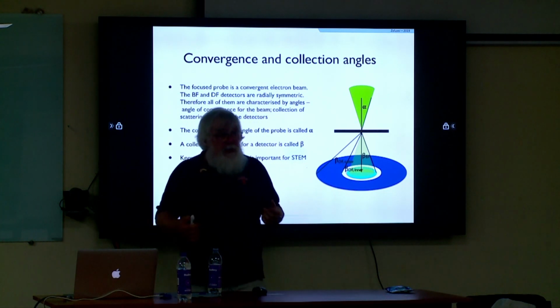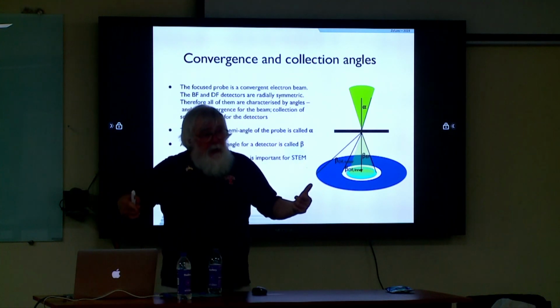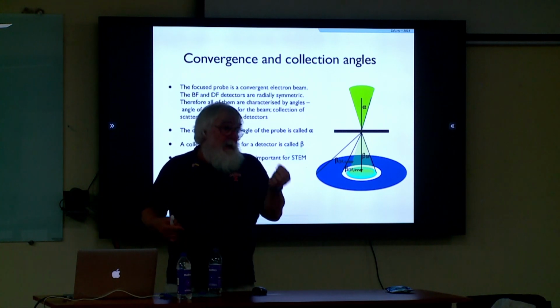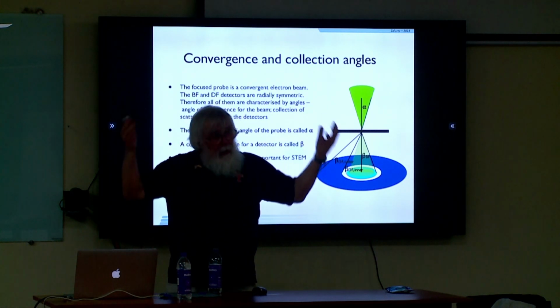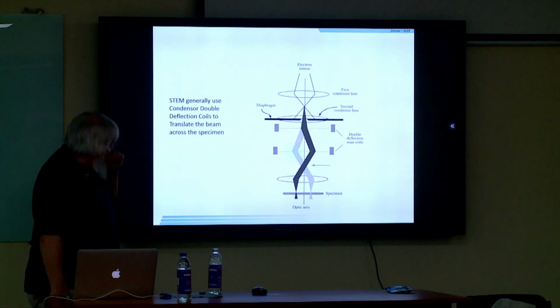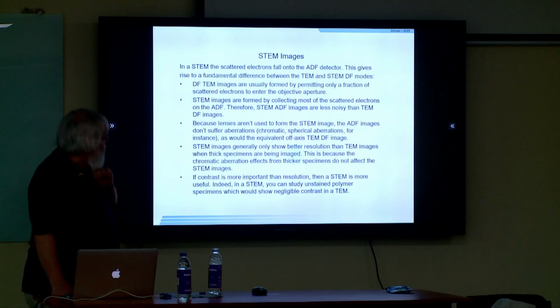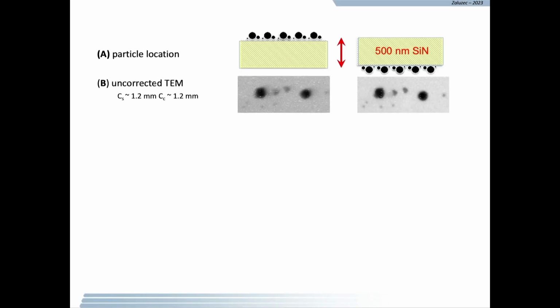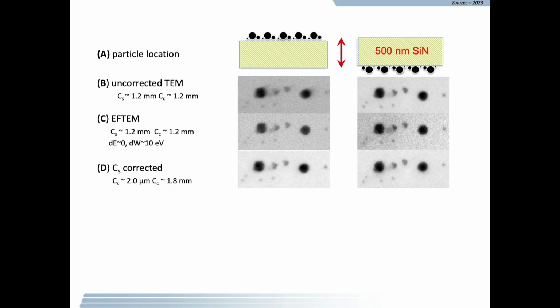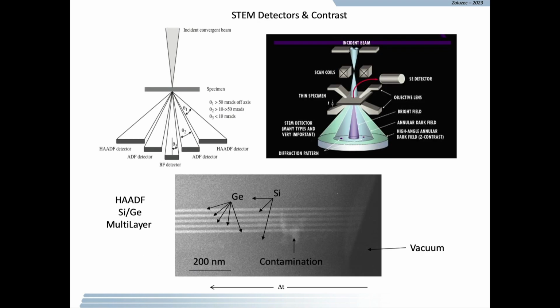So what are we doing in STEM? We're gathering more signal than we do in TEM. In TEM, we only take a small fraction of it. Now, in STEM, we can get all of that signal and then use it as appropriate. I'm going to skip this slide.